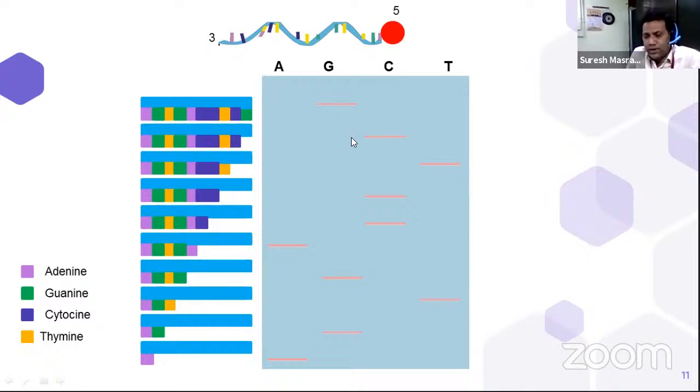Alongside, there may attach a single nucleotide during the course of replication, because we put the dideoxynucleotide, and it is possible that the firstly formed nucleotide itself is a dideoxynucleotide. Once a single dideoxynucleotide is attached to the primer, it does not allow the attachment of other nucleotides. Therefore, replication is arrested here.